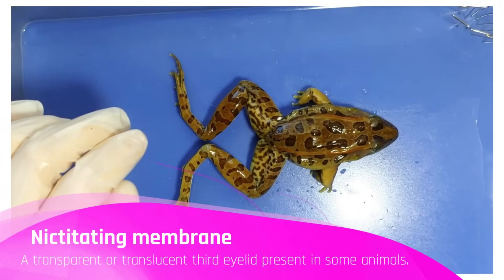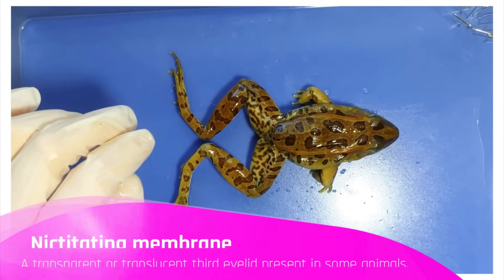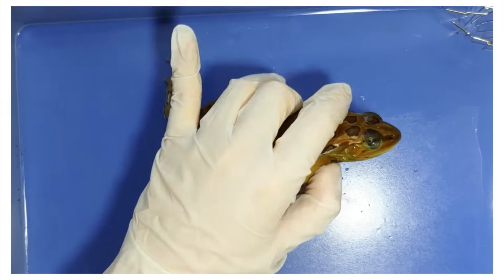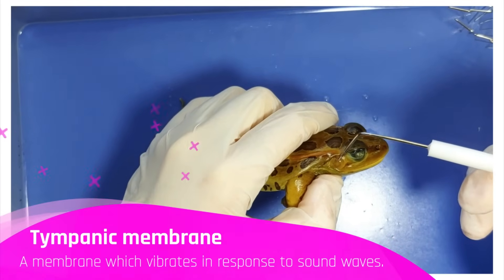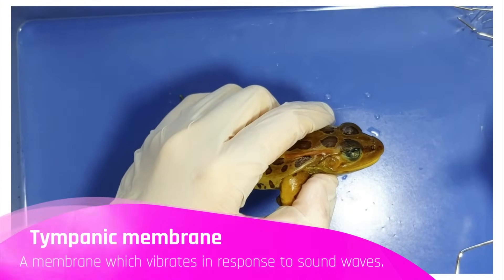This is also called the third eyelid and is drawn across the eye laterally — it functions kind of like swim goggles. Here is the tympanic membrane, which vibrates like an eardrum and allows the frog to hear both on land and underwater.